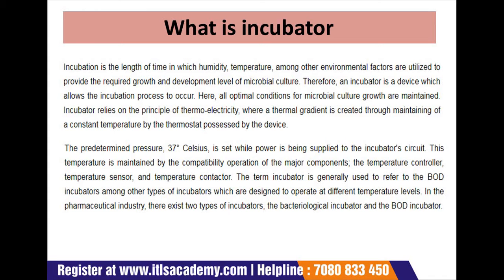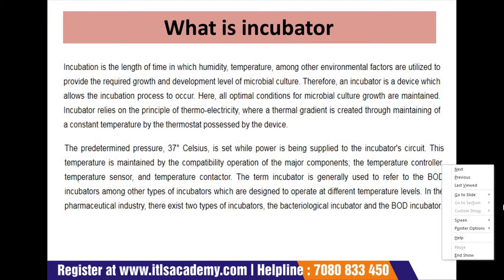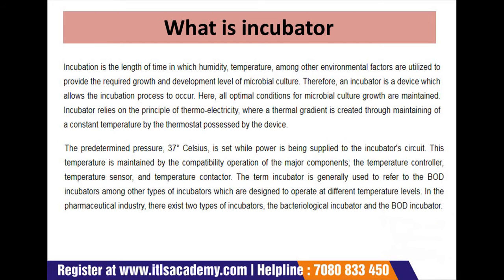So let's discuss what an incubator actually is. An incubator is a chamber in which humidity, temperature, among other environmental factors are utilized to provide the required growth and development level of microbial culture. Therefore, an incubator is a device which allows the incubation process to occur. Here all optimal conditions for microbial culture growth are maintained.